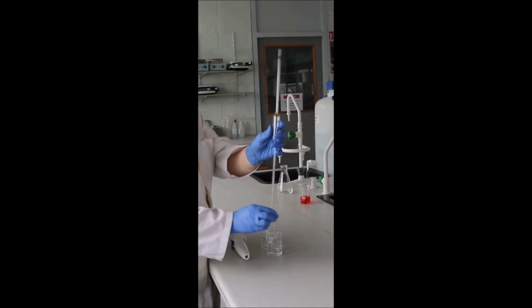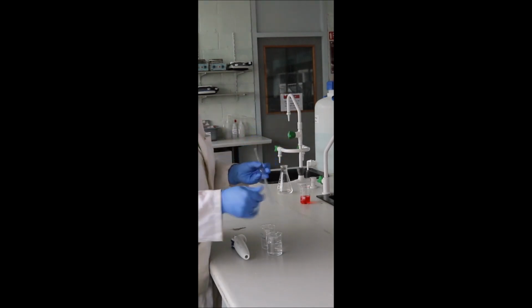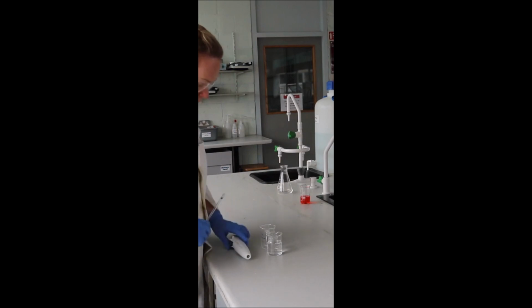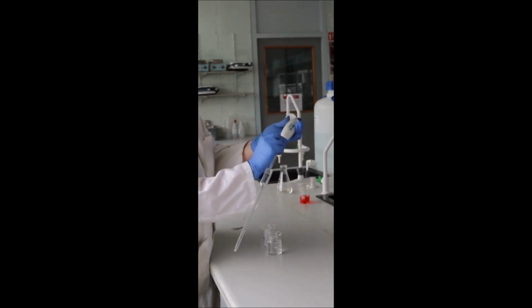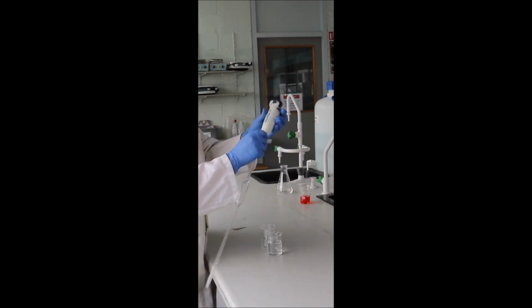You should always check the top and bottom of the pipette to make sure the glass is not damaged or broken before you attach the filler. To attach the filler, you should hold the pipette near the top and use a slight twisting motion to insert gently into the mouth of the pipette filler.